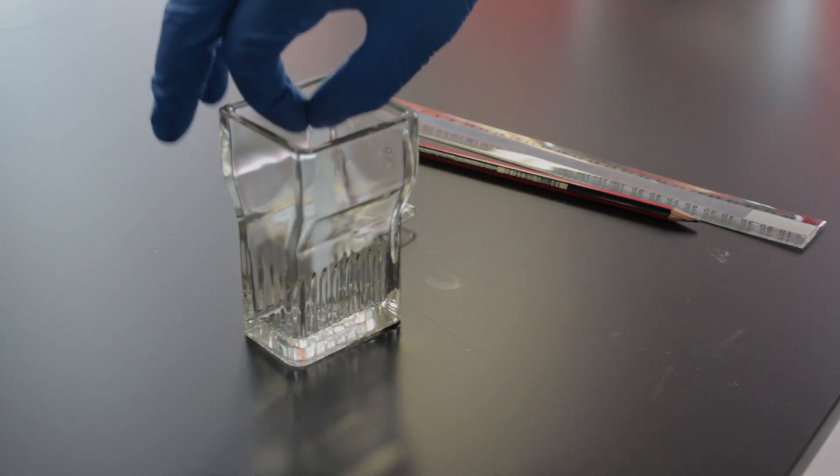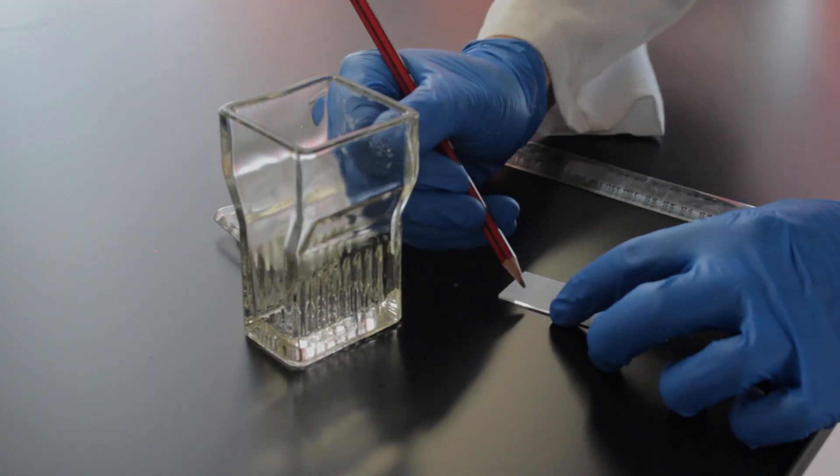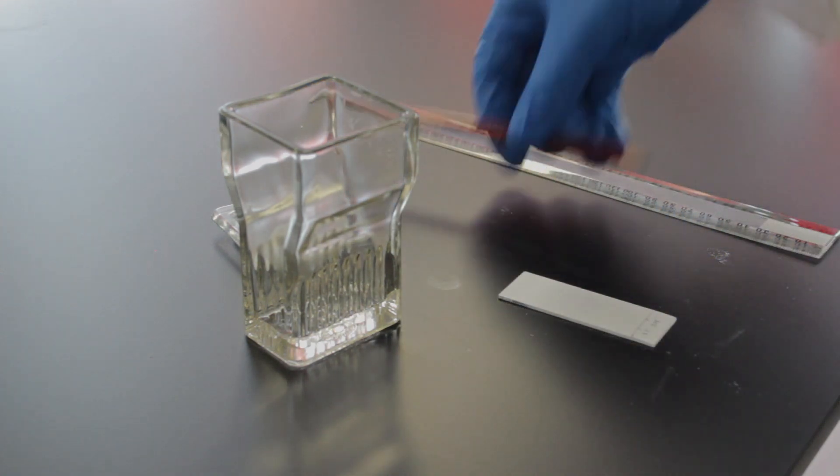Once the solvent line has almost reached the top, carefully take out the plate and immediately mark out where the solvent front has reached. This is so that we can calculate the RF values later.